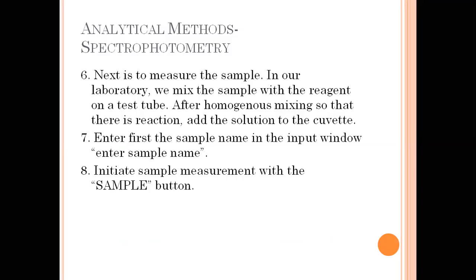Okay, so next is to measure the sample. So in our laboratory, we mix the sample with the reagent in a test tube. So it's not that you directly mix the reagent and the sample using the cuvette.